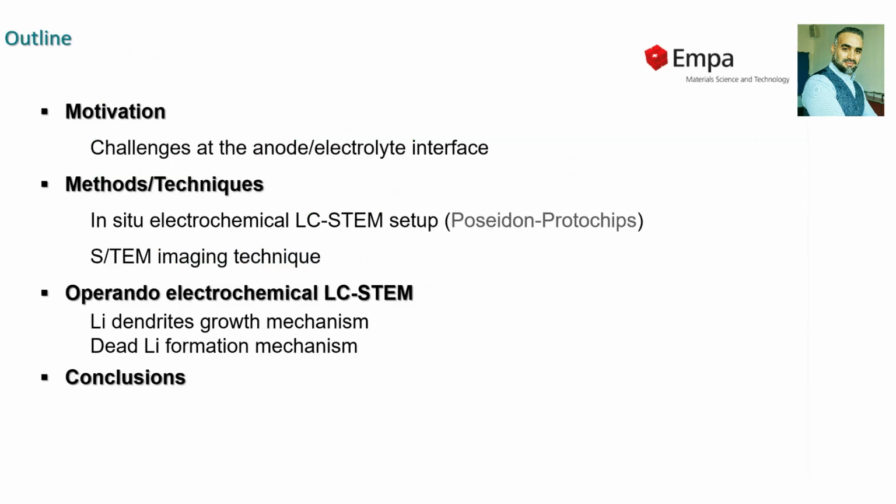My talk will start with the motivation about the challenges at the anode electrolyte interface, and then I will show you the methods and techniques used for our in situ experiments and the STEM imaging techniques, of course. After that, I will give you some details about our study of the lithium dendrites and the dead lithium formation mechanisms, and I will finish with a short conclusion.